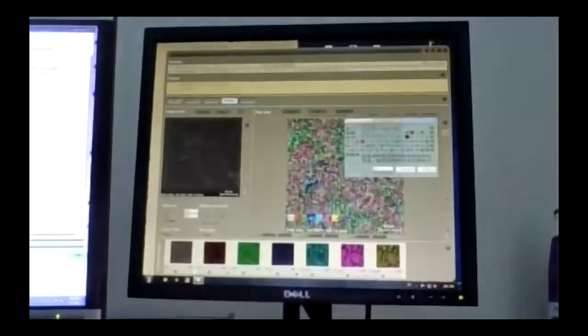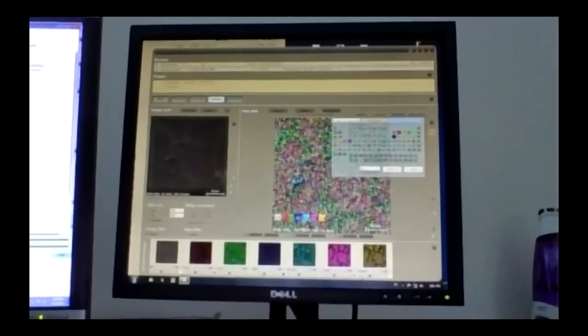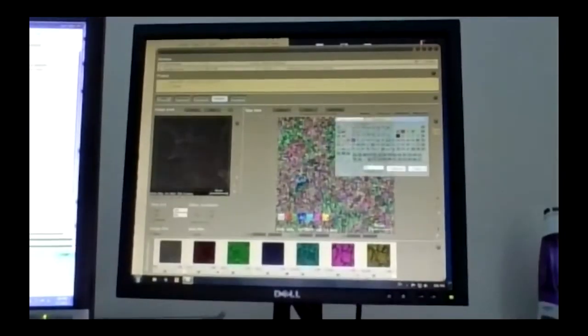Yep, sorry for that. My computer turned off, so you didn't see the map, did you? No, you didn't, sorry for that. Do you have some idea when it stopped? Did you check the map? Can you see the map now?